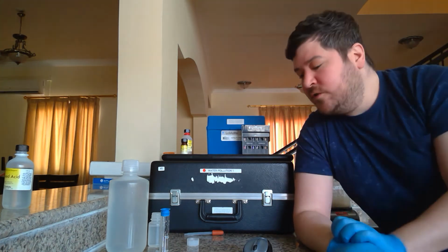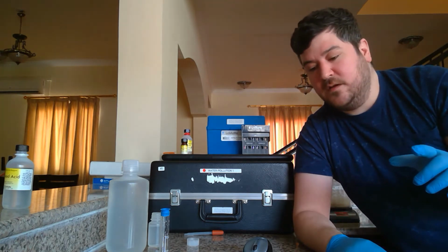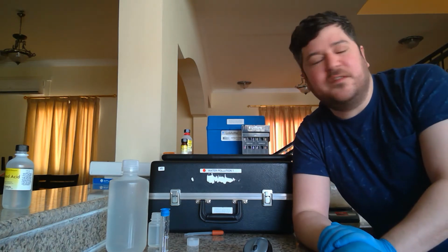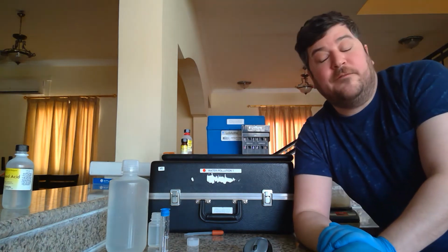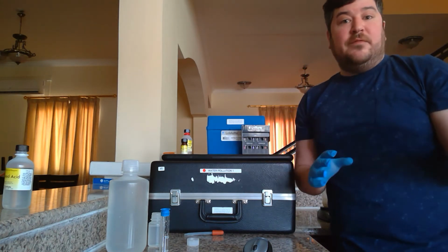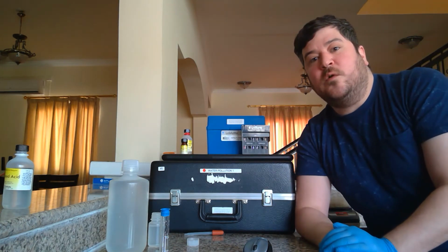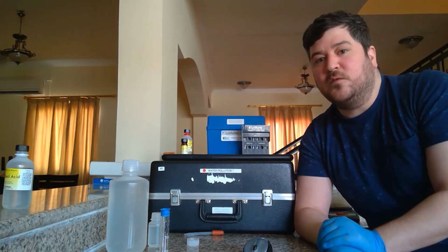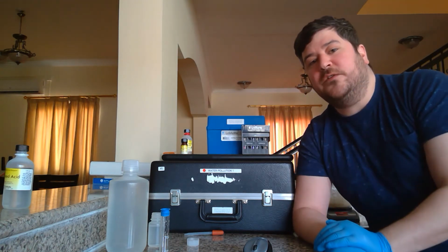Before I do that, it does mention something in the beginning of the procedure that we need to consider for this test. It says that nitrites, so we're testing for nitrates, nitrites can cause serious interference in this test and should be determined separately and compensated for if present. Now, we don't have a nitrite test here, or even back in the lab. This doesn't come with a nitrite test kit. So there's a little bit of error there. I don't have any way to see right now if there are nitrites in this water.